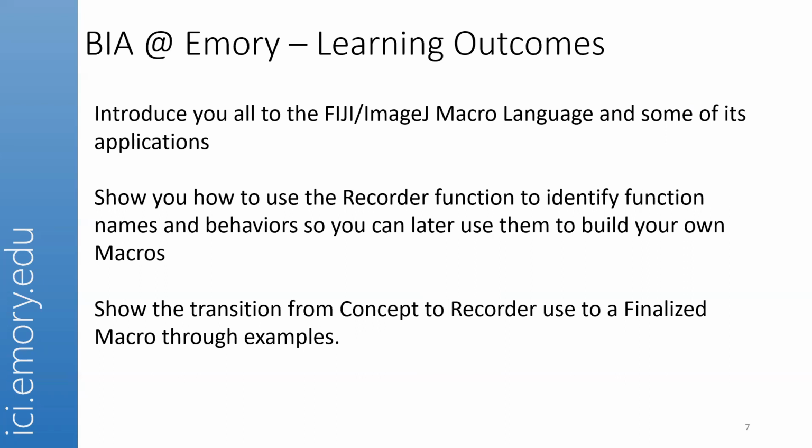I want to show you how to use the recorder function in Fiji specifically, because that is a very powerful tool that you can go through by hand and it will let you know exactly what kind of functions Fiji is calling and using while it's performing your analysis.